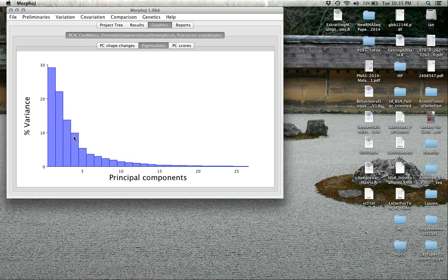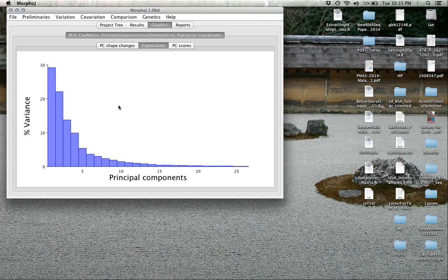There's diminishing returns. You can almost see that by the time you hit about five dimensions, you've really covered about 80-85% of the overall variation, and we'll probably look at that directly in the reports section.